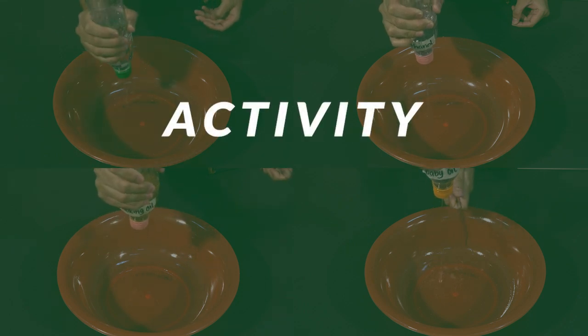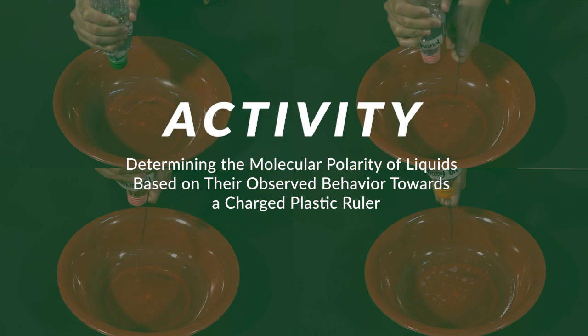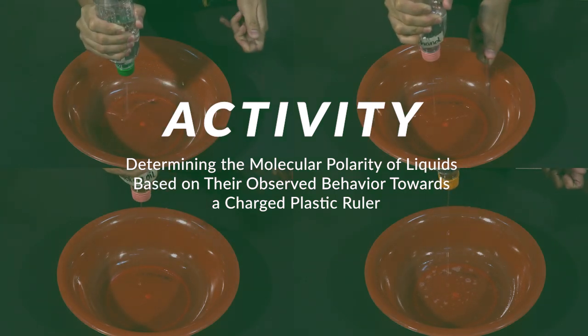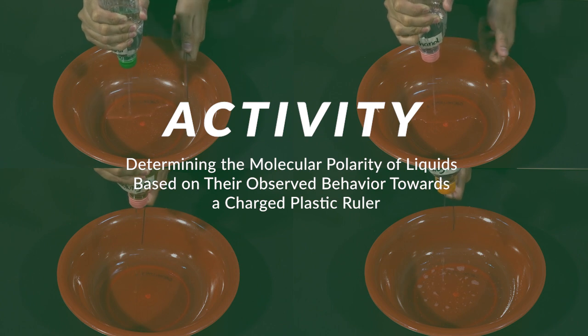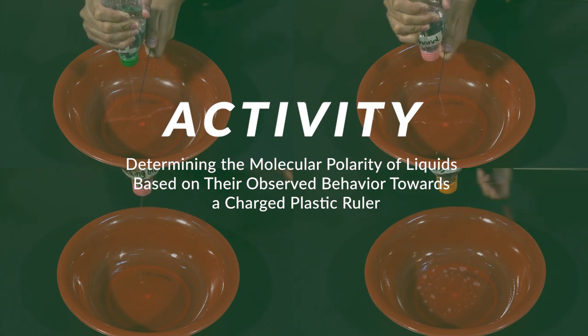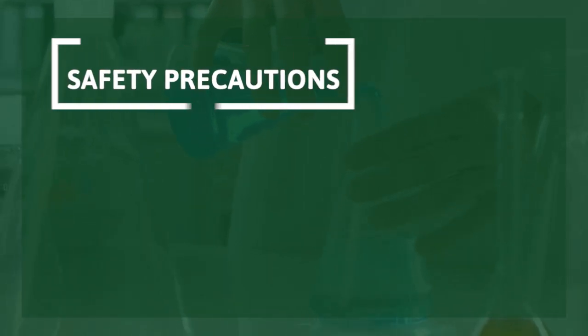In this activity, you will determine the molecular polarity of liquids based on their observed behavior towards a charged plastic ruler. Before, during, and after doing the activity, it is important for you to follow the safety precautions. Here are the safety precautions for this activity.